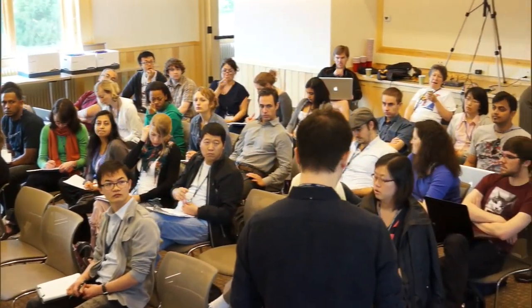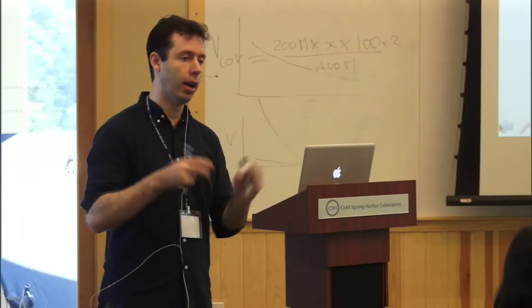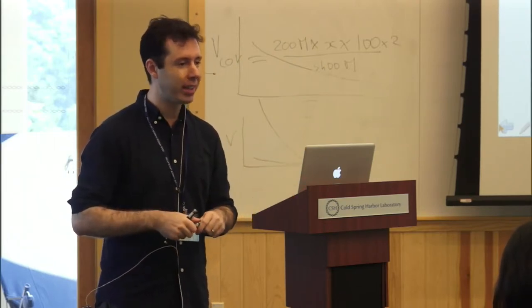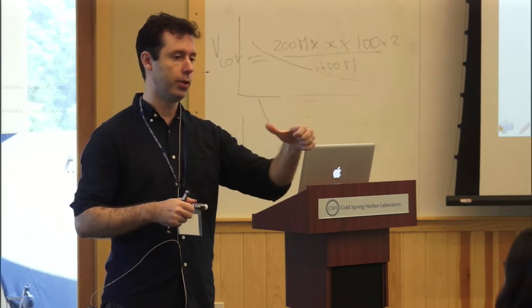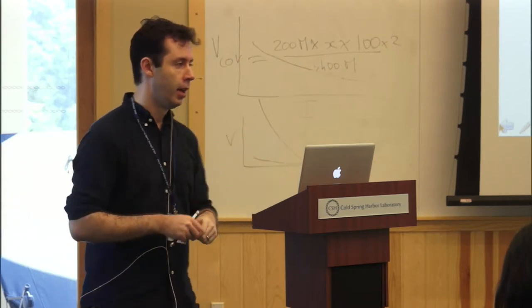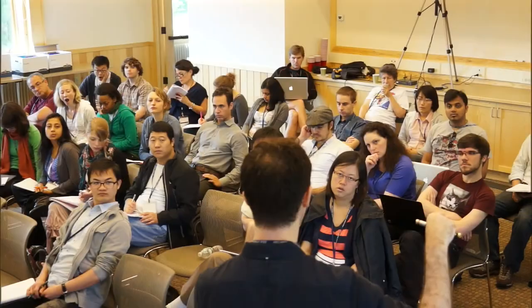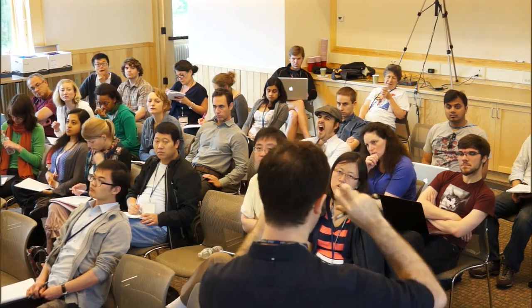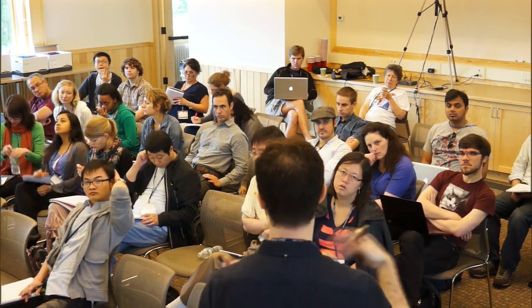Another way to think about it is that you can let the software trim the end, in a sense. In practice, a lot of software is not very good at this. One of the parameters that goes into the software is how many mismatches you allow between the read and the reference genome. If you have reads with mistakes towards the end, plus some mismatches in the middle of the read, it adds up in terms of number of mismatches, goes above the threshold that you allow, and that read is going to be filtered out.